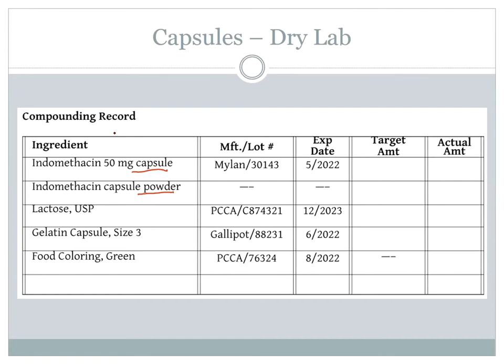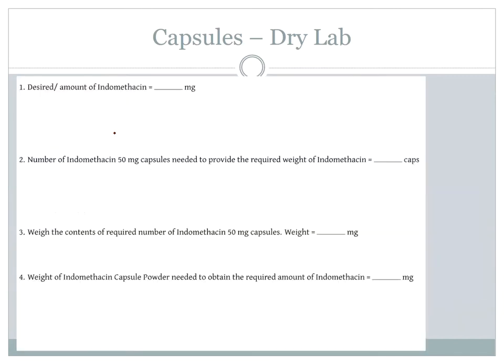You must indicate the color of the capsule. So that should say gelatin capsule size 3, clear. Make sure you add that on there. And then lastly, we're going to add a drop of food coloring to help visualize the mixture. And you'll see that when Judy does it here in a minute. Okay? So we now know everything we need to know to do our calculations. So let's do our calculations. Are you ready? Get your calculator out. I want you to do these as well. Okay.